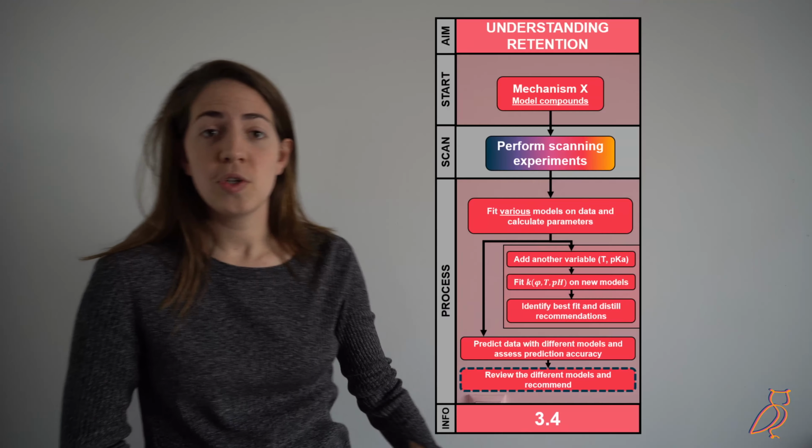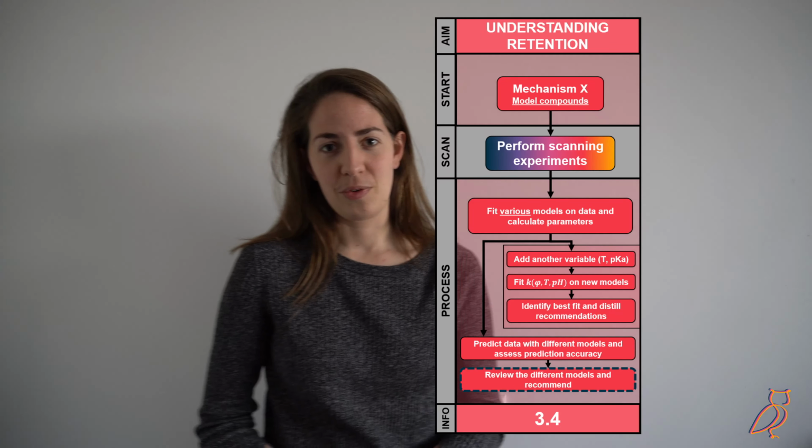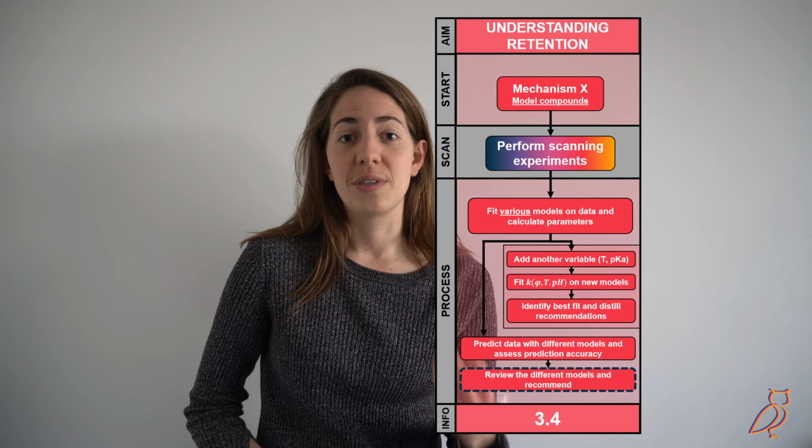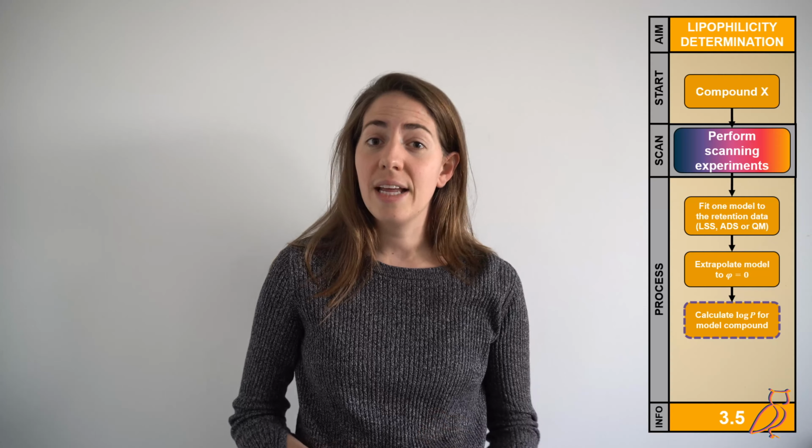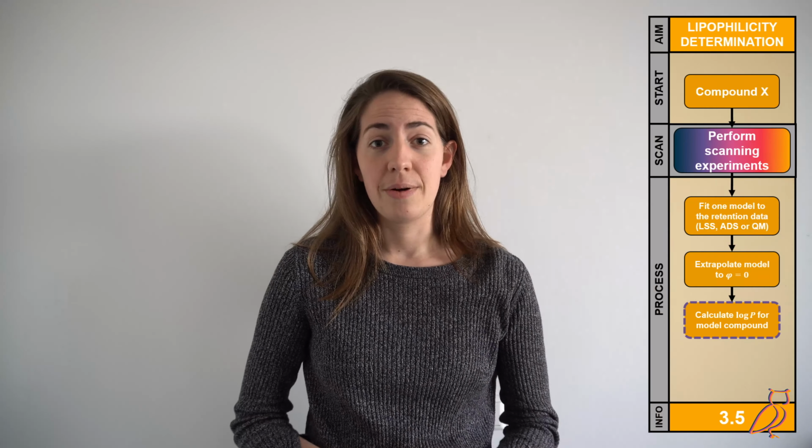In the fourth approach, we do the more extreme science performed in retention modeling to try to understand retention to a deeper extent. And in the fifth approach, we do lipophilicity determination, where we try to relate analyte retention parameters to their polarity. Are you getting a better understanding of what retention modeling is?